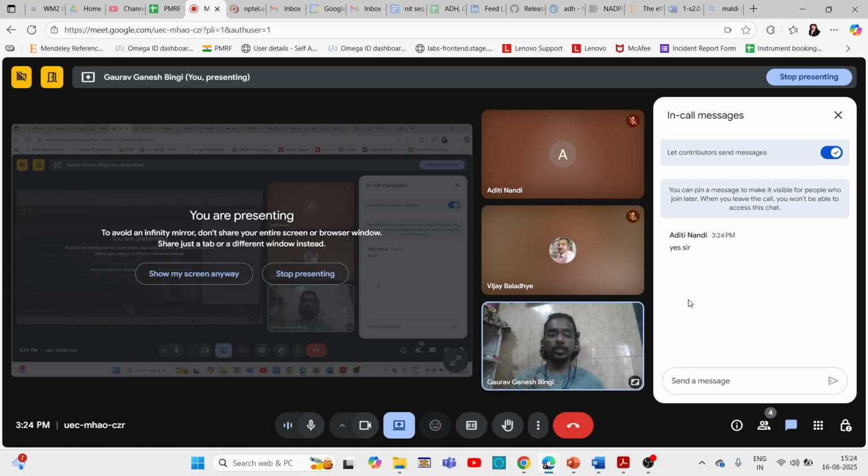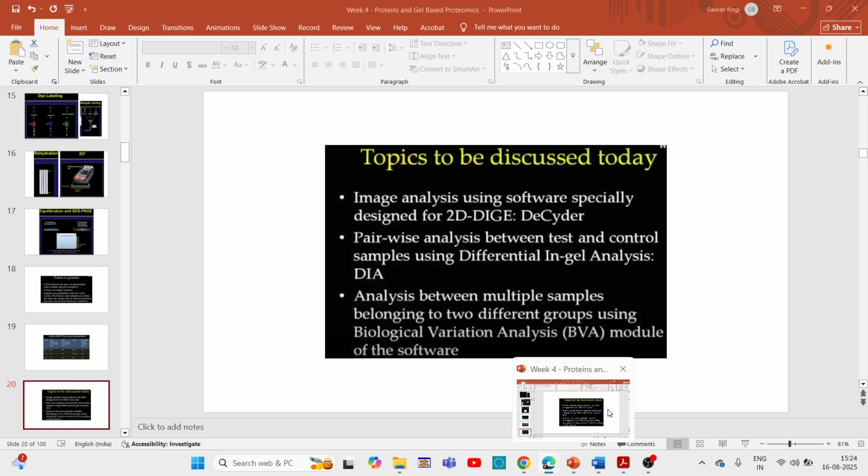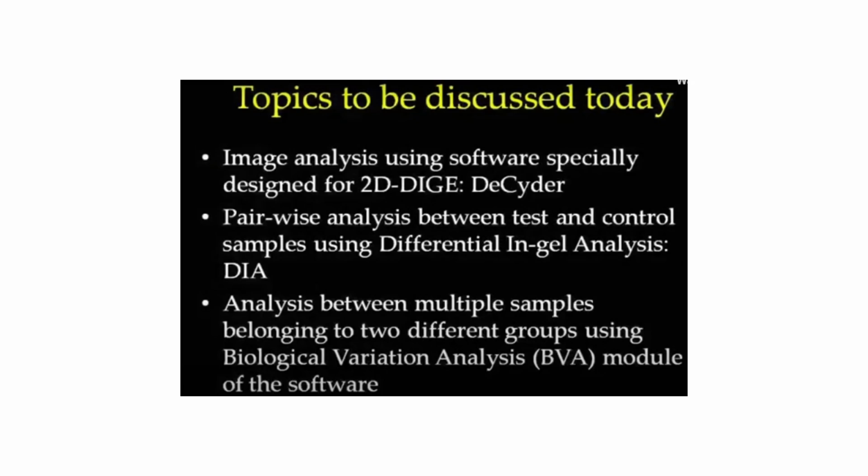So we'll go ahead. That was the first part of the lecture which sir talked about in week 4, lecture 5, all those 5 lectures. Coming to part 2 of the week 4 lecture, sir majorly talked about how we can use the software, with one of the professors from GE Healthcare.